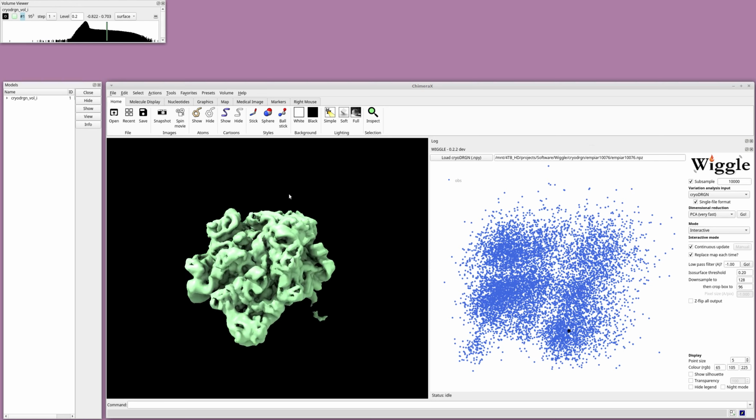You can play with this latent space. You can scale it with the right click button. You can also export images of this latent space if you want to include those in your publication, say an image file.